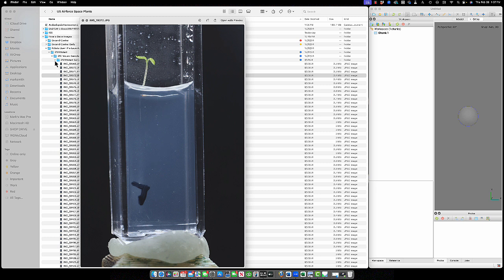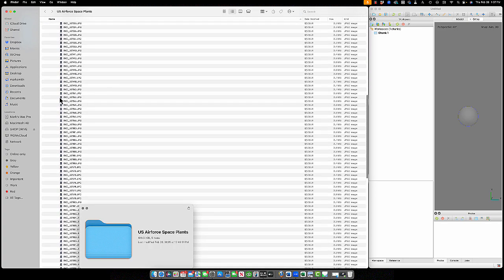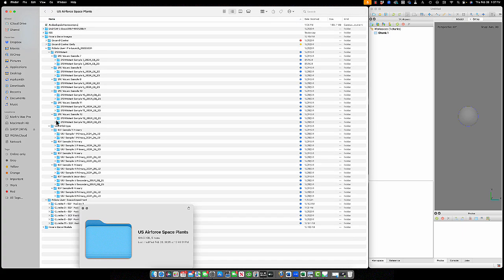What it does is it clouds it, and it causes the roots to go out of focus. So we don't need absolute clarity. We really just need structure, because all we're trying to do is 3D model the root paths. And we do have good image data showing what the roots did as backups. But of course, yeah, we want to get good 3D models of every single sample.